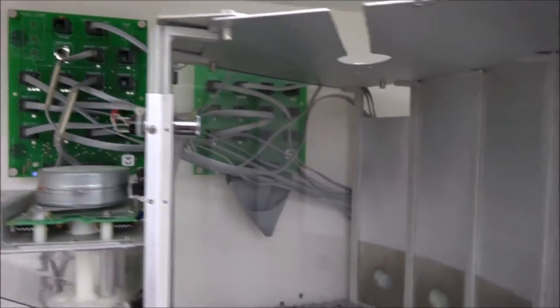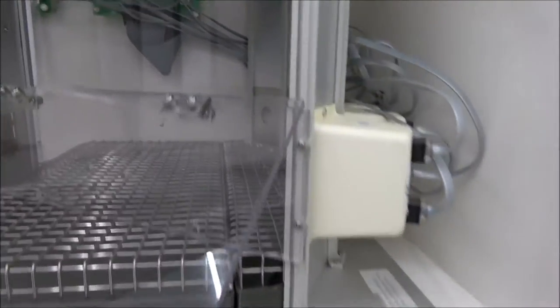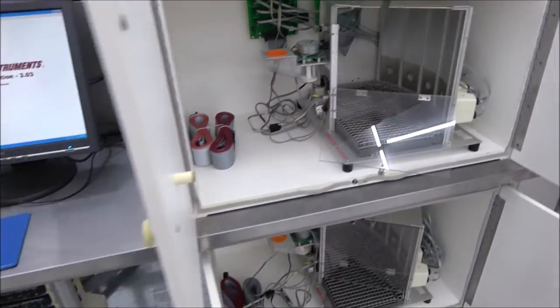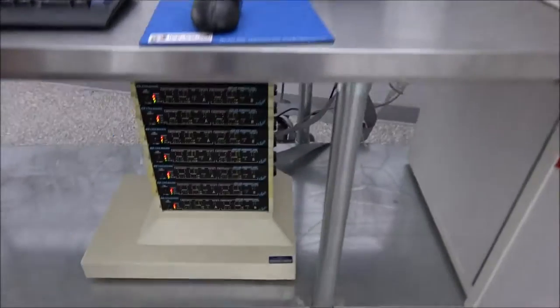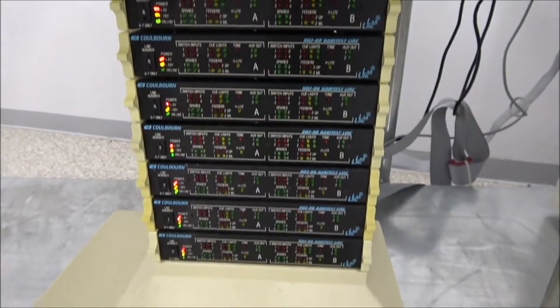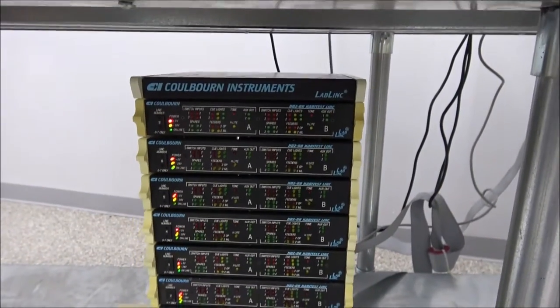It's a turnkey system, and I'm going to move over here and show you a little bit about the software. But I'll just get a shot of the tower first. You can see it has eight modules on it.